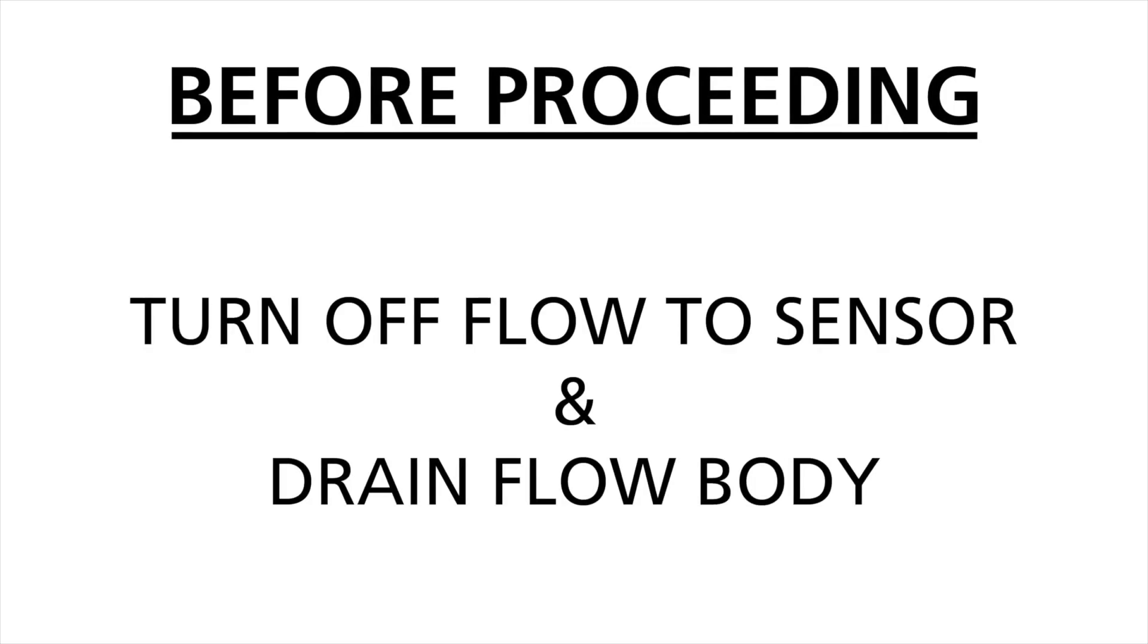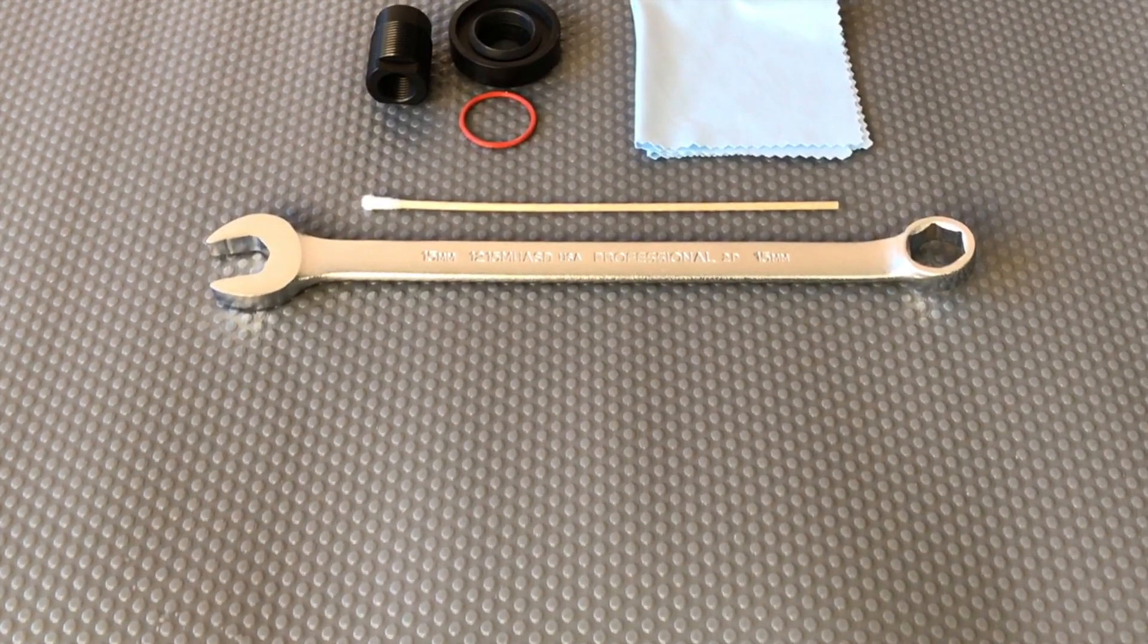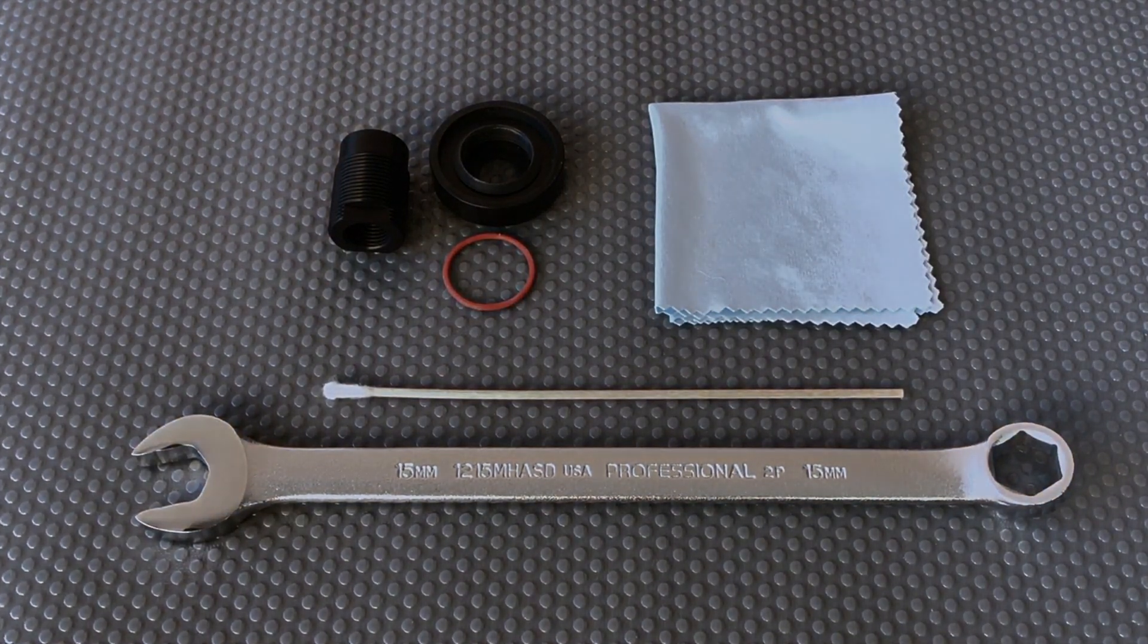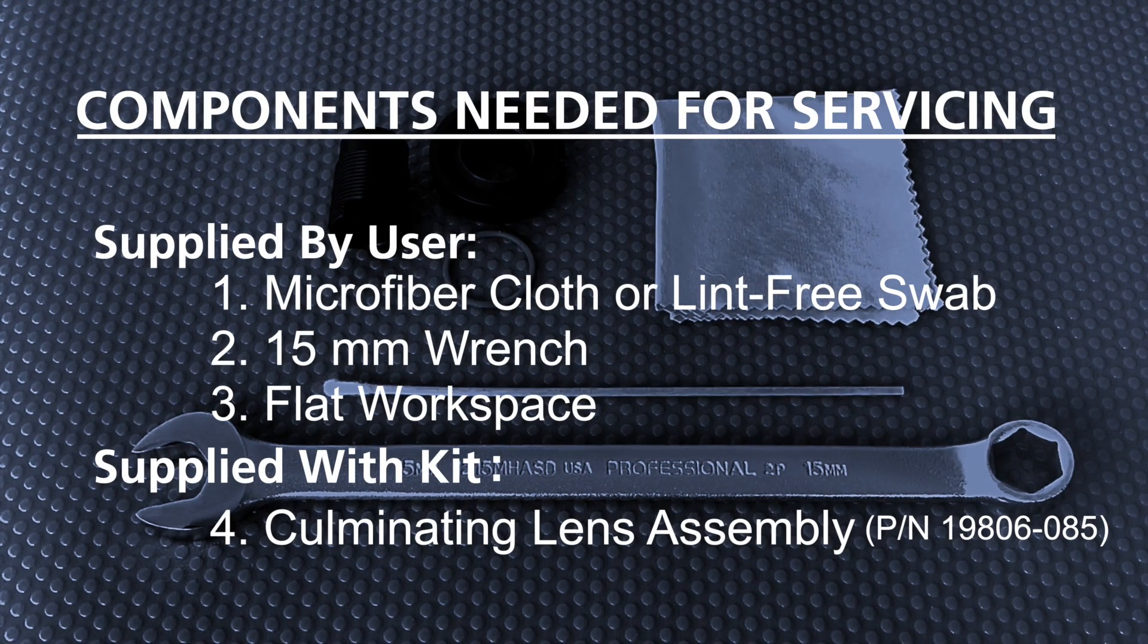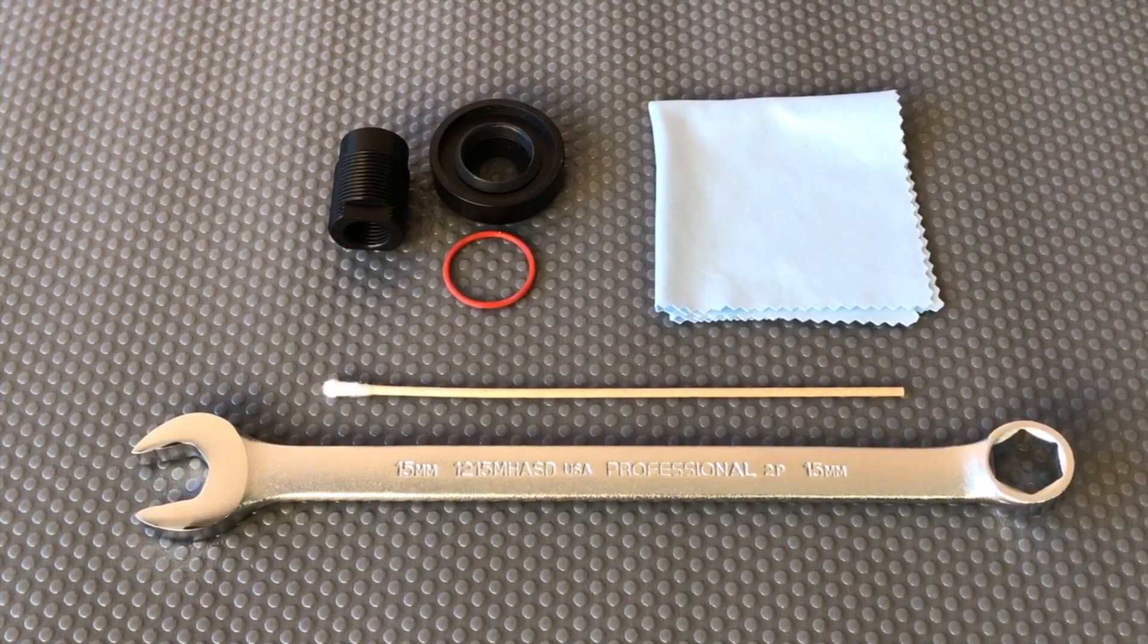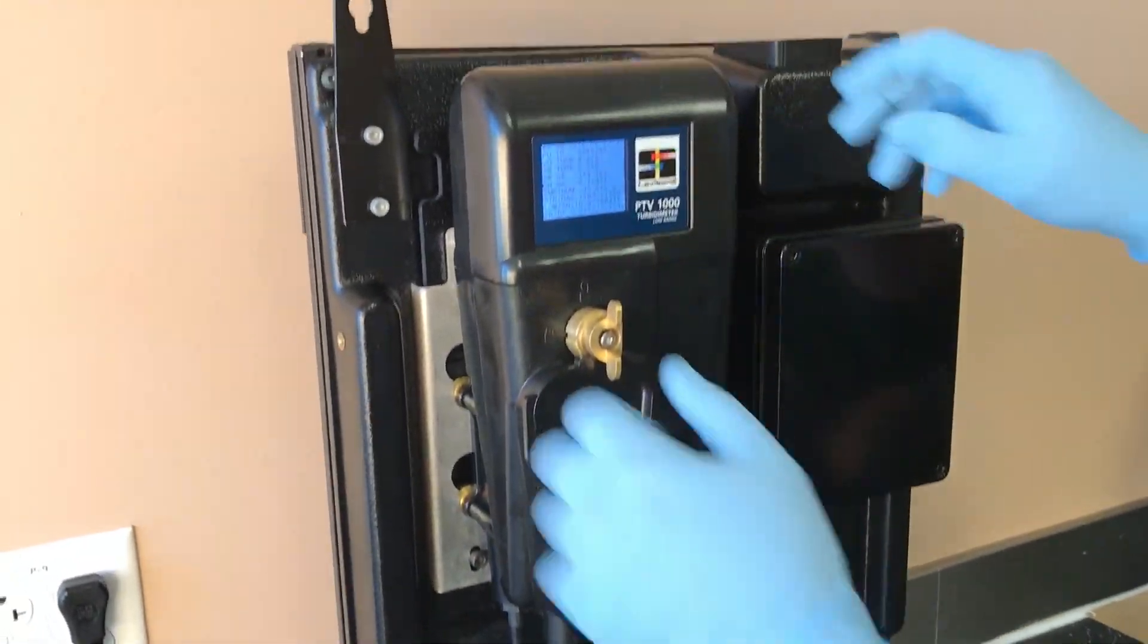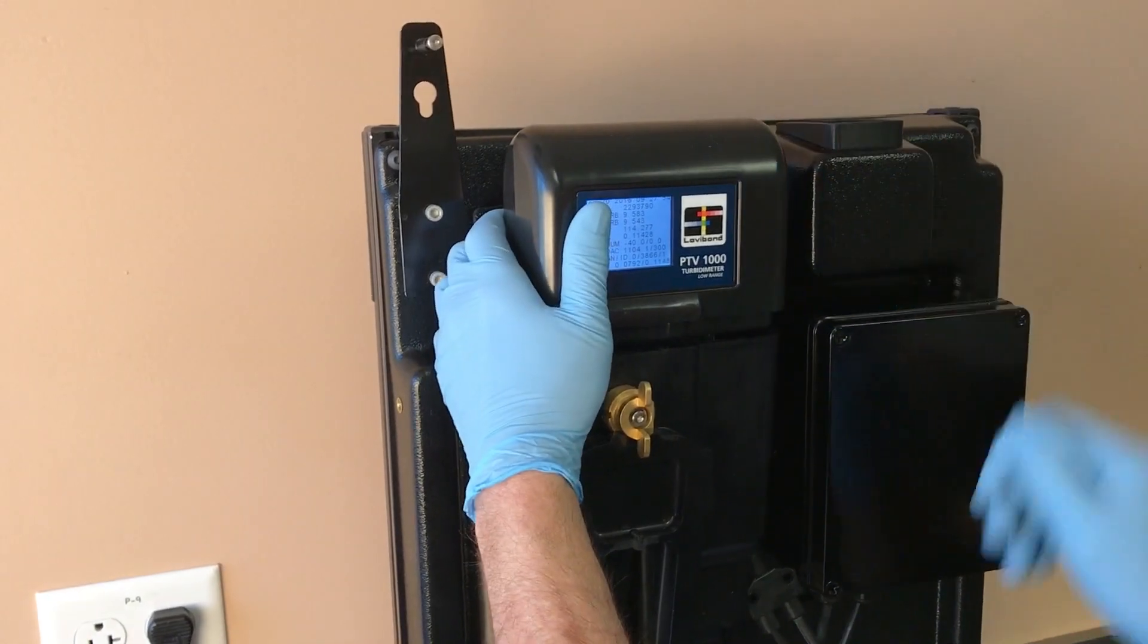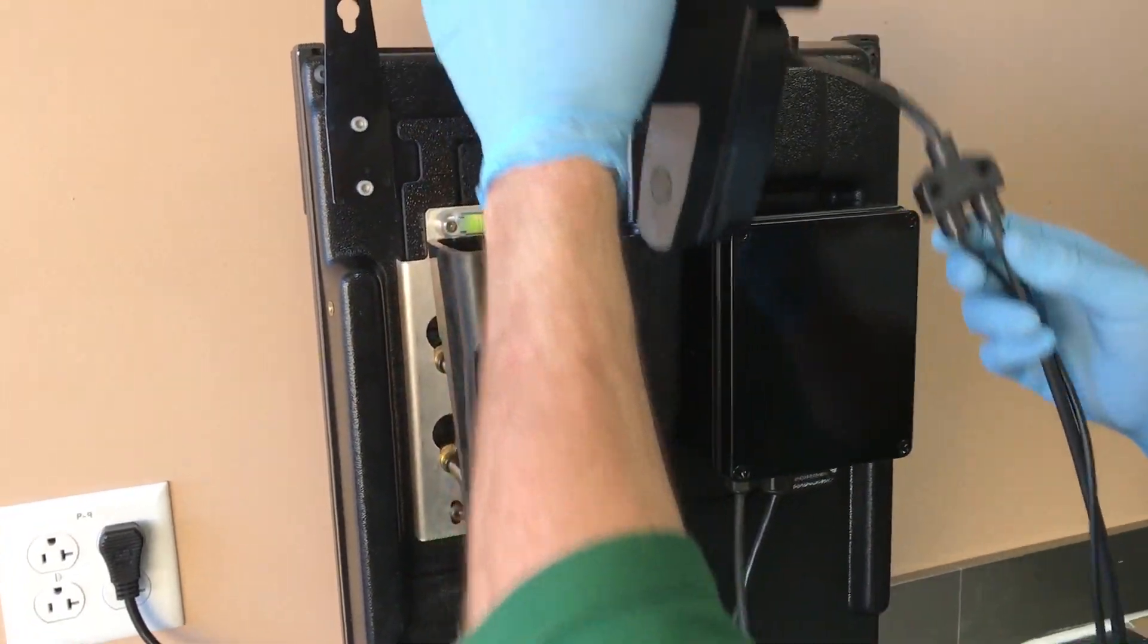It is necessary to turn the flow off and drain the body before proceeding. To begin servicing, remove the measurement module from the flow body.